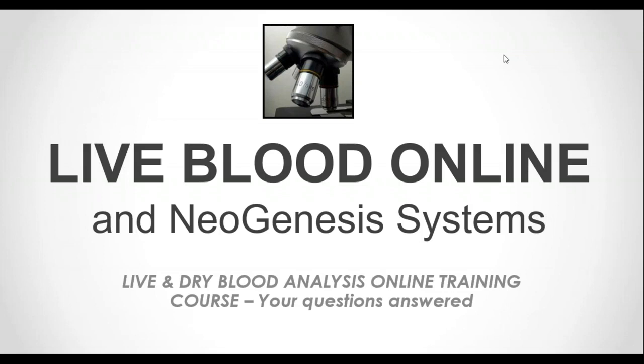The microscope also needs to have a dedicated dark field oil immersion condenser, which is usually interchangeable with a bright field condenser. Good quality optics, of course, are very important to prevent aberrations, and also a wide magnification range. Now, in live blood, we tend to use very high magnification, at least 1,000 times on the viewing screen. And in dry blood, we tend to use low magnification. So our microscopes typically have a magnification range of 40 to 4,000.